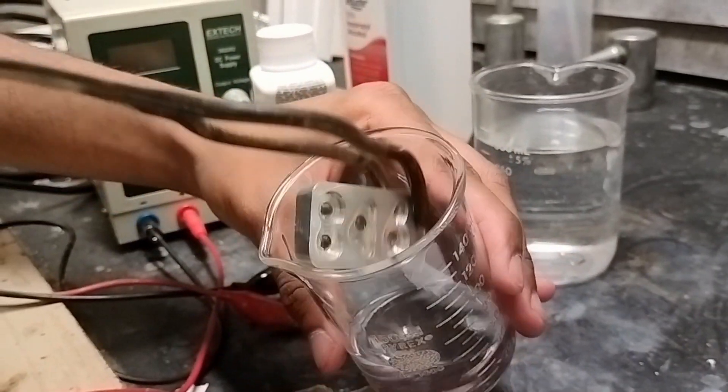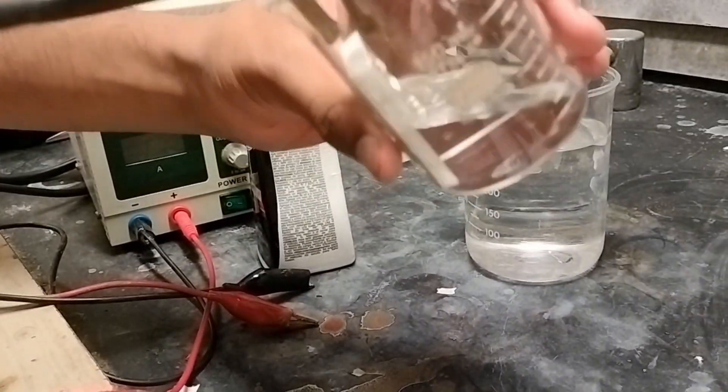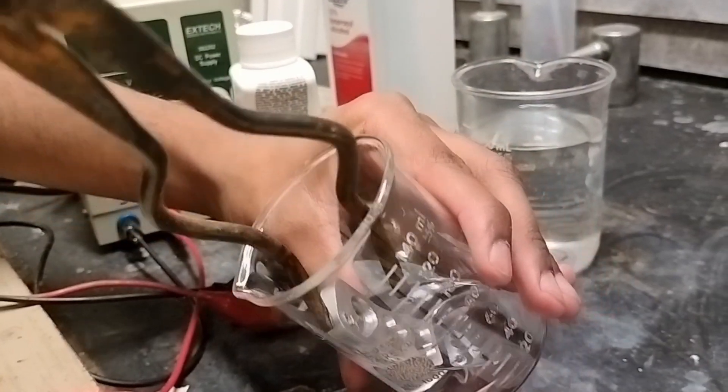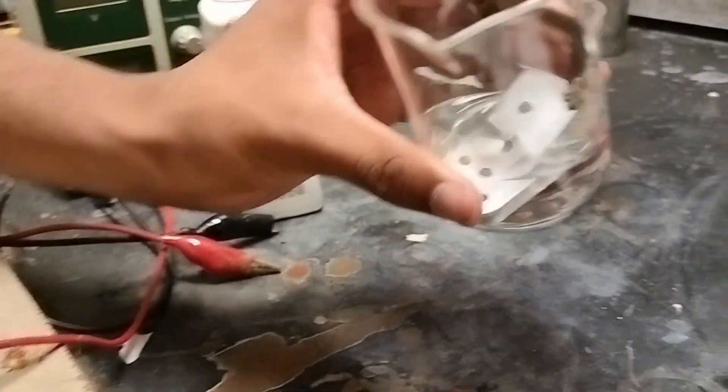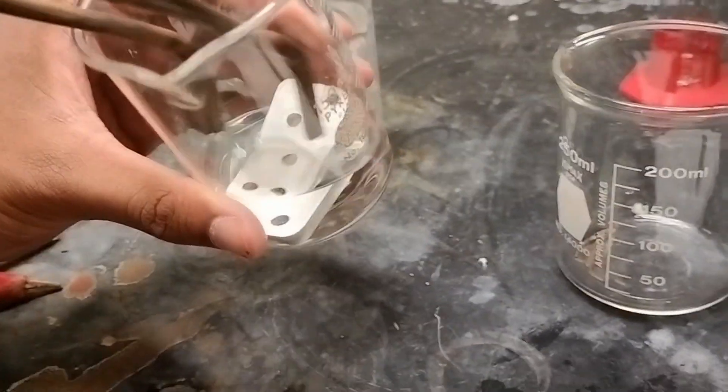My first step in the experiment was to degrease my aluminum part. I did this to remove the dirt off my part. First, I sanded my part down using 300 grit sandpaper. Then, I cleaned the part using isopropyl alcohol.